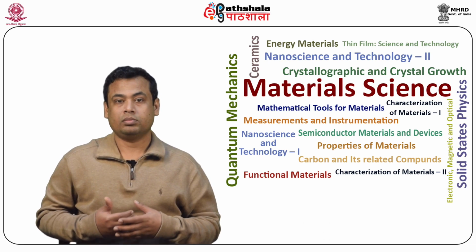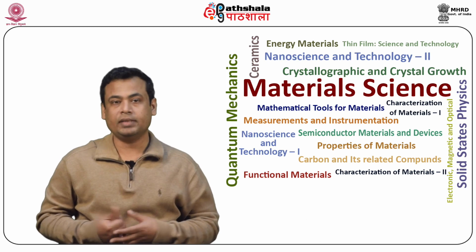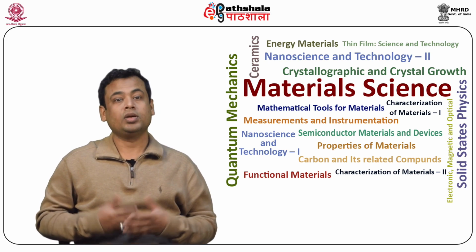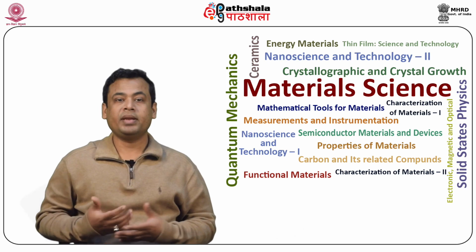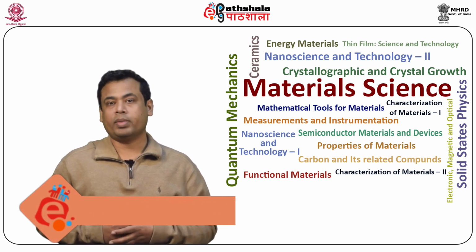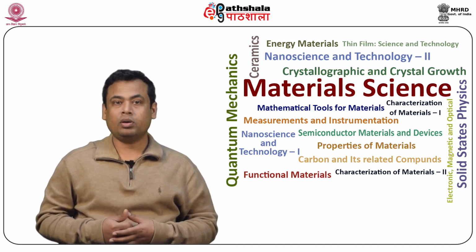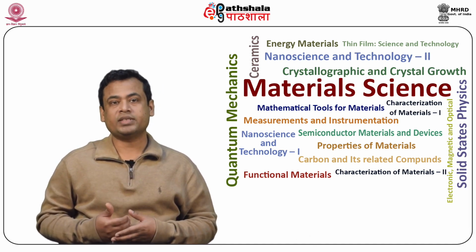Filter fluorometers and spectrofluorometers are utilized to record the fluorescence spectra. Fluorescence spectrometry is used in many areas of biology and medicine, and filters or monochromators are normally used to remove the pollution or stray light from the wavelength that is used to excite the sample.